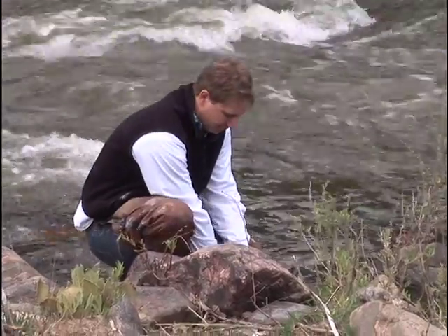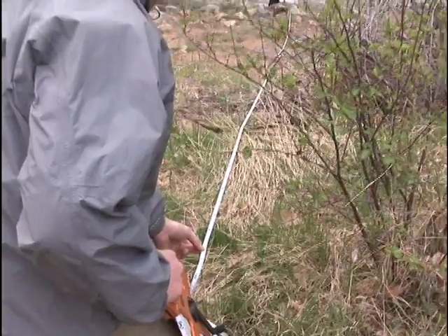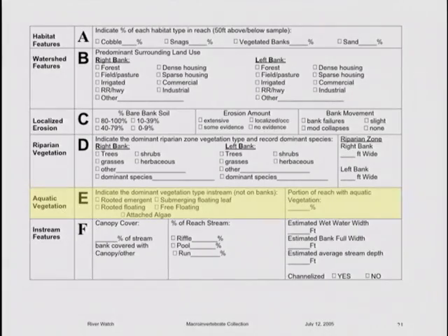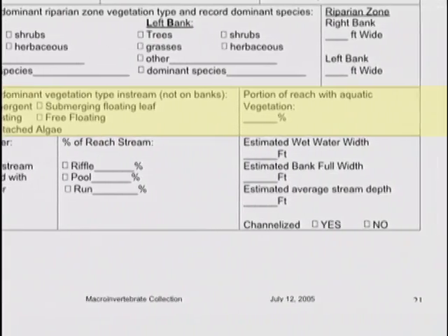Now we need to measure the riparian zone width on both banks. Use your tape measure to measure the riparian zone from the water's edge to the end of the riparian zone. Section E. In-stream aquatic vegetation of the overall area. This section focuses on vegetation in the stream only, not on the banks.